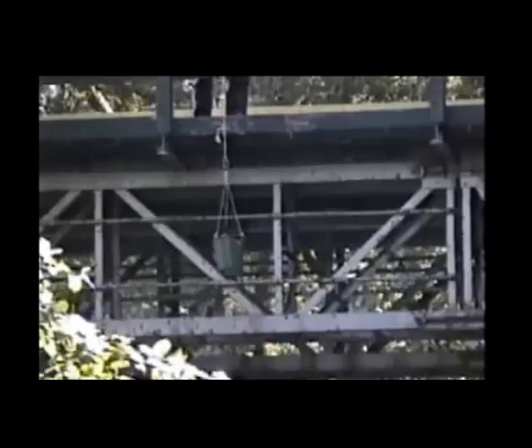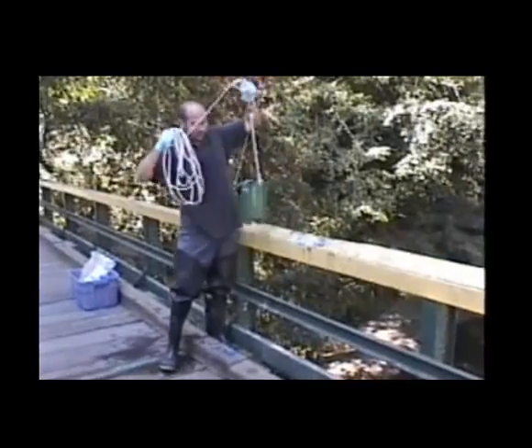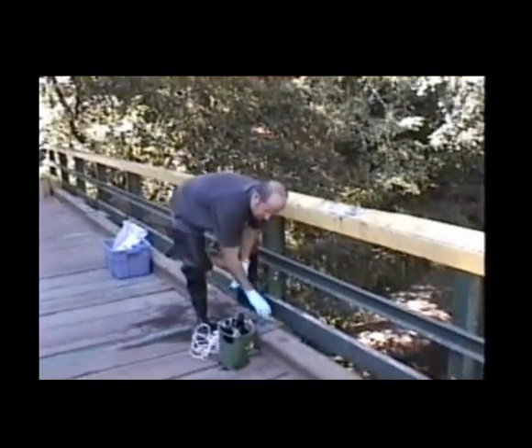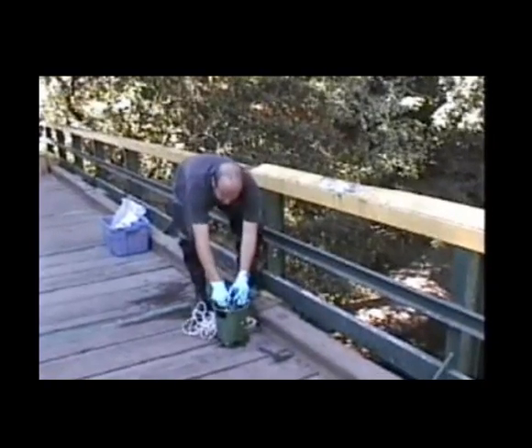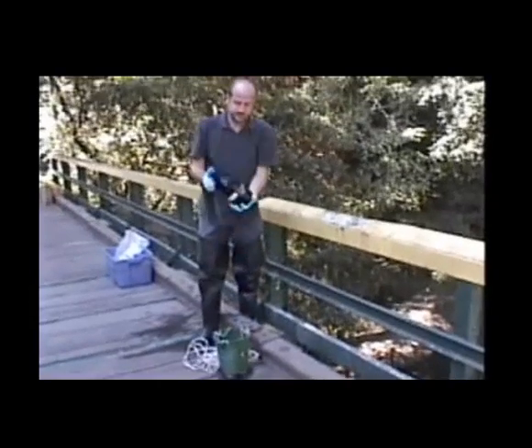After the bottle has been rinsed 3 times, we then fill the bottle completely to the top. Cap the bottle. The water sample is complete.